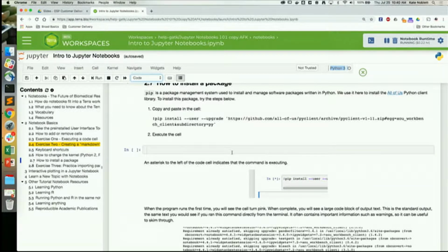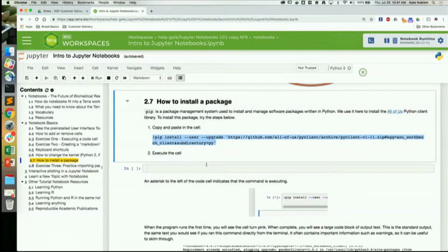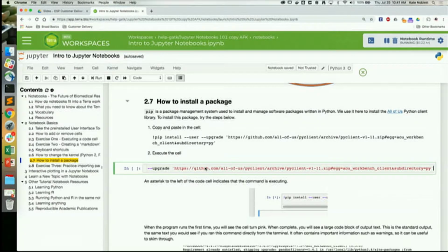Because a lot of the exercises in this notebook you can now basically do yourselves. Everything is explained thoroughly in the notebook, which is another nice part of the notebook. The markdown cells can give you both instructions and screenshots. They do exactly this, and then right below is a live code cell, and you do exactly that. So here it says copy and paste this, and see if it works. Copy, paste, and there it goes.